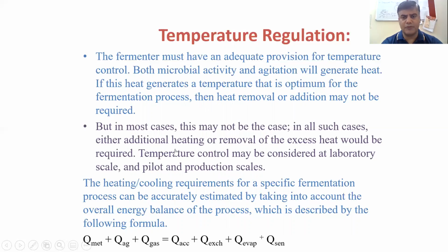Sometimes the temperature is very high and the heat is excessive, so there are possibilities that the fermenter will blast. But in most cases, this may not be the case. In all such cases, either additional heating or removal of the excess heat would be required. So there will be heating control and cooling control. We have to maintain the balance of the process, which is described by the following formula.